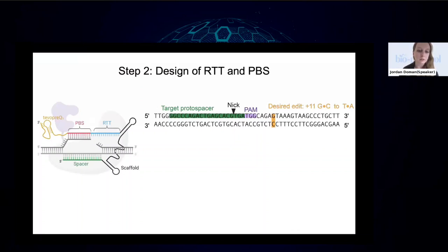The other constant part of the pegRNA that we haven't talked about is this tevopreQ1 motif. So it stands for trimmed evopreQ1, and it's just a highly structured motif that is used to stabilize the pegRNA, prevent its degradation, and this really improves prime editing efficiencies quite a bit across the board. And this was actually an advance that was co-invented by Peyton, so we'll direct any questions about this to him later on.